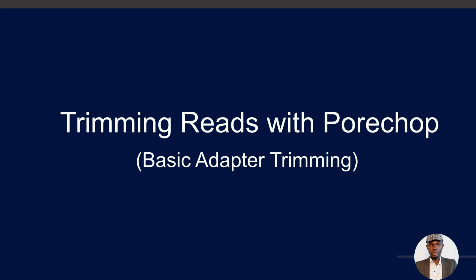In today's video, I am going to show you how to trim Nanopore reads using the tool Porechop. For this tutorial, we are going to perform a basic adapter trim. So let's go to the Porechop documentation page to look at the example command.